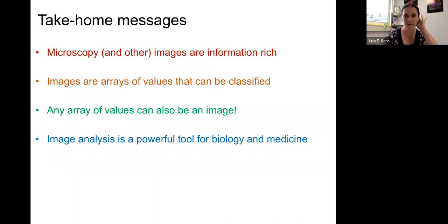I don't want to leave out the chemists and the soft materials people. My mind is churning away on ways that image analysis can be used to tell you things about your materials. And I know that this kind of approach, especially deep learning segmentation, is widely used for materials characterization.